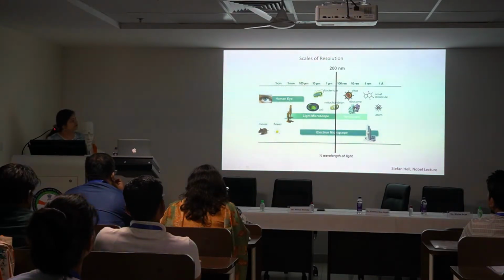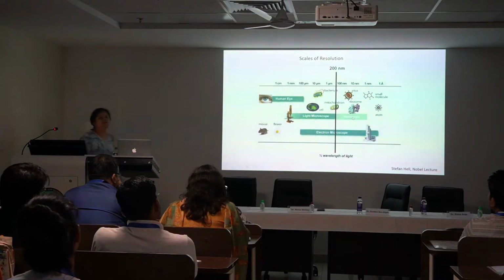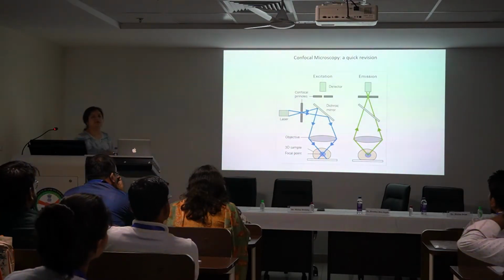Electron microscopy, of course, can go a lot further, and the goal for super resolution is in this region, where it is trying to improve the resolution better than 200. Okay.